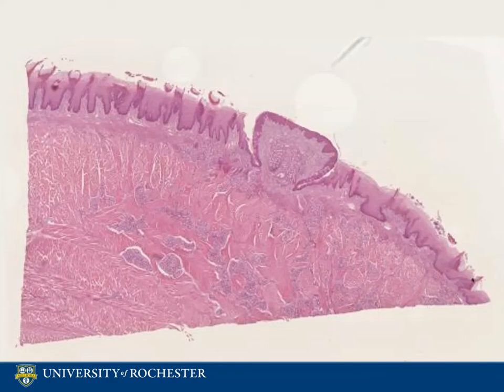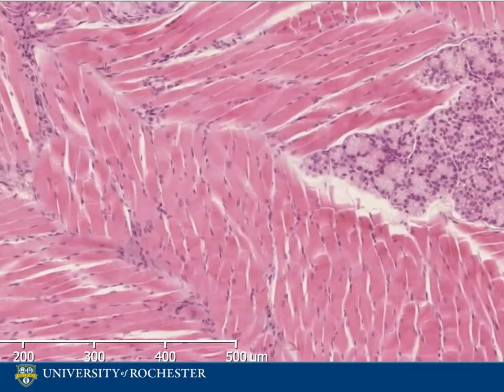One primary characteristic of skeletal muscle is the presence of striations, as can be seen here and throughout the tongue. The appearance of these striations is due to the presence of sarcomeres, which are the fundamental unit of muscle fibers and are composed of actin and myosin filaments. The overlapping of these two filaments allows the muscle to contract.